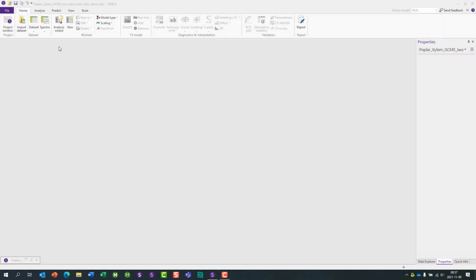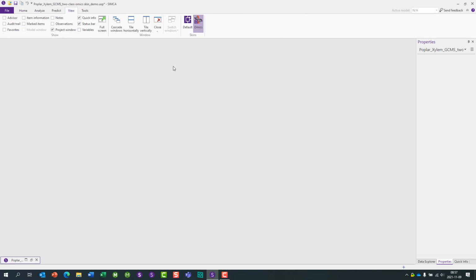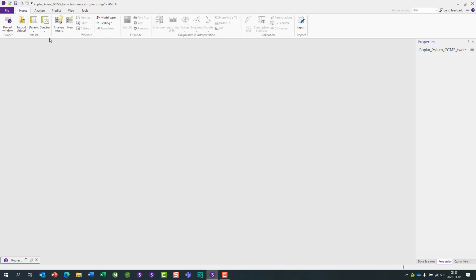So welcome to this how-to video that will show you how to work with the Omics skin in the SIMCA software and notably its analysis wizard. If you don't see the Omics skin, you have to click on the View tab and there select the Omics skin instead of the default skin. When you select the Omics skin, the shape of the Home tab will change, and on the Home tab we have put buttons that indicate a certain workflow, and we have also grouped very useful tools nearby each other.